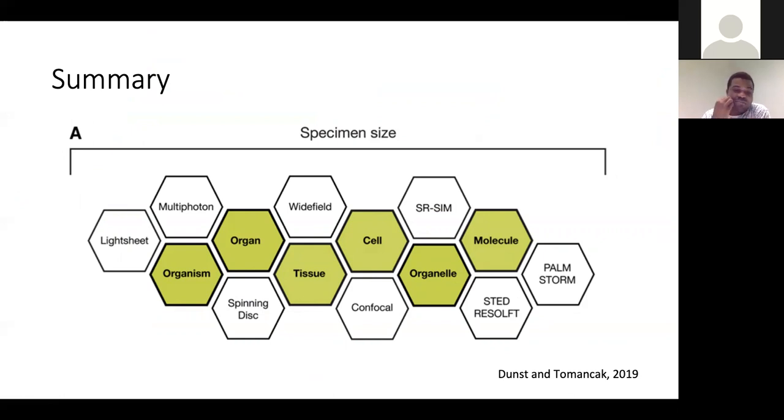So the first part of my summary talked about the different microscopes, and the second part tells you at what level of data or imaging mode you can use the different microscopy technologies. If you're looking at single molecules, a STORM, a SIM, and a STED will be able to capture that single molecule for you.